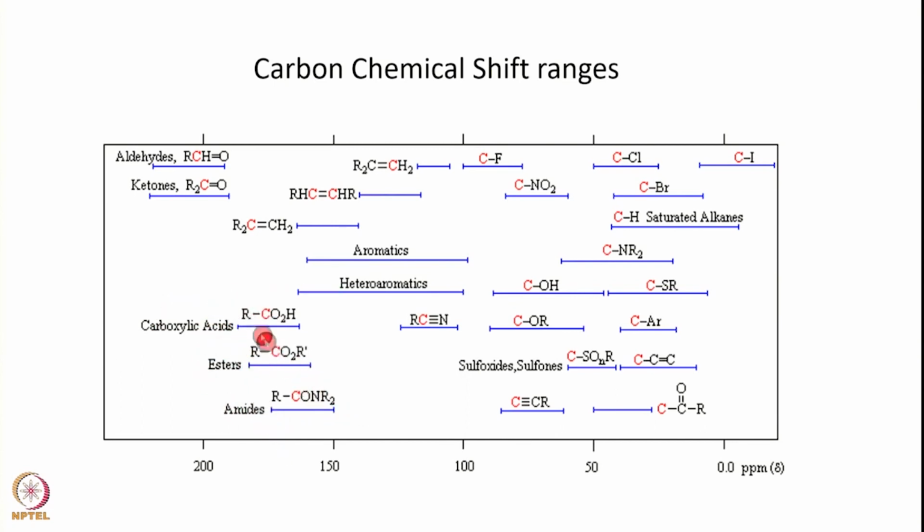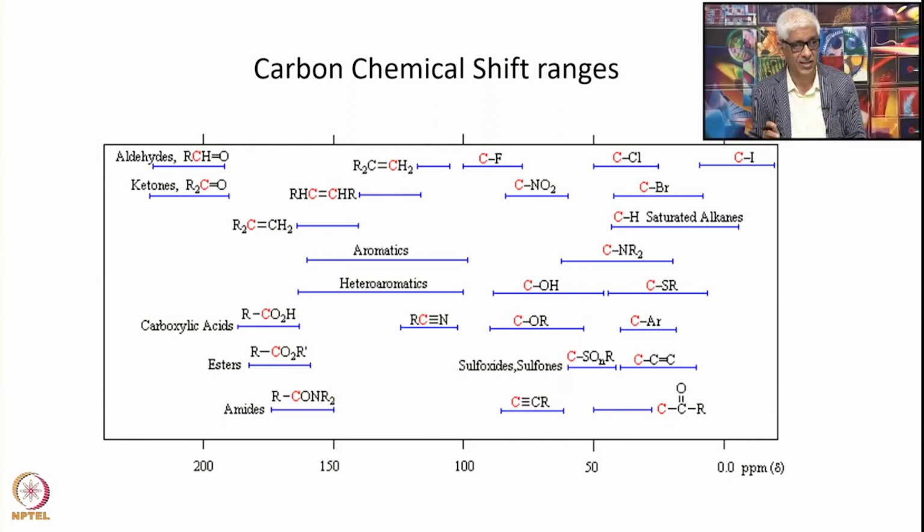So you see typically the carbonyl carbons appear in this area, aromatic carbons appear in this area, aliphatic carbons appear in this area, and mostly we will be dealing with these kind of chemical shifts when we deal with proteins or nucleic acids, because there you have the aliphatic carbons, they will all appear in this area, and the aromatic carbons, the carbonyl groups in peptide bonds and things like that, they will all appear in this area, aromatic carbons in this area, and so on and so forth. Phenylalanines and all of these aromatic rings in amino acids, they will appear in this area.